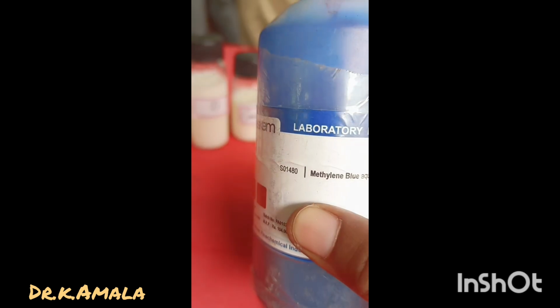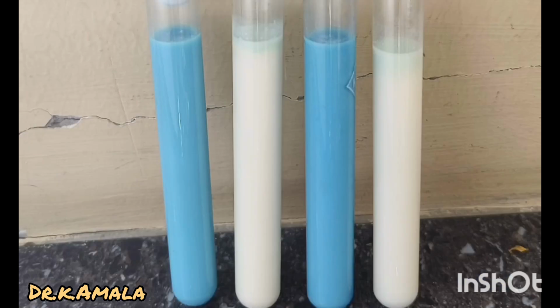The MBRT works by adding methylene blue dye as an indicator to the milk sample, which turns blue in the presence of an oxidizing agent like oxygen. If the milk contains a high number of bacteria, the dye will be reduced and the solution will turn colorless, indicating poor quality of milk. It is totally unfit for human consumption.